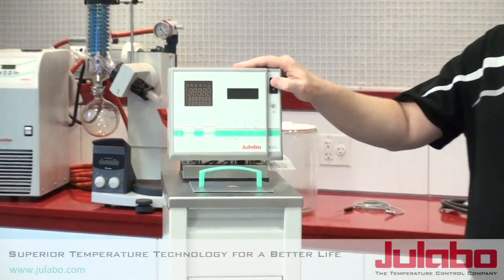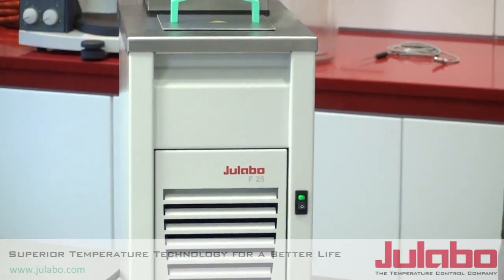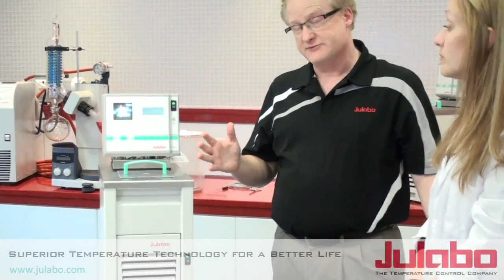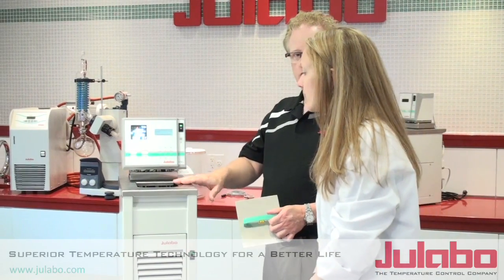The first self-test is on the circulator head and the second is on the refrigeration portion, so it'll go through and test itself to make sure everything's okay. You'll get an alarm — no problem with the alarm, it's because we haven't put any fluid into it yet. You would add the fluid in here, and then the low-level alarm would go off.